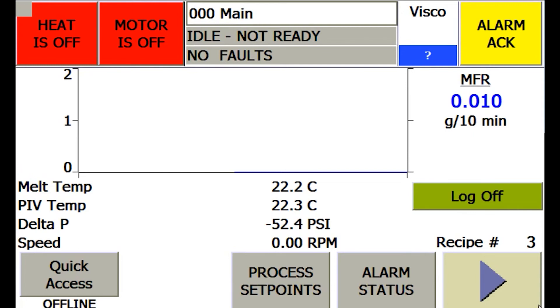Each system boots to a main screen that looks like what you have here. The system parameters shown are fully configurable and are covered in the operation configuration video.